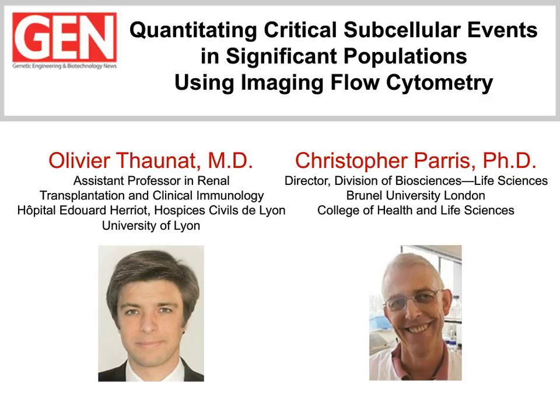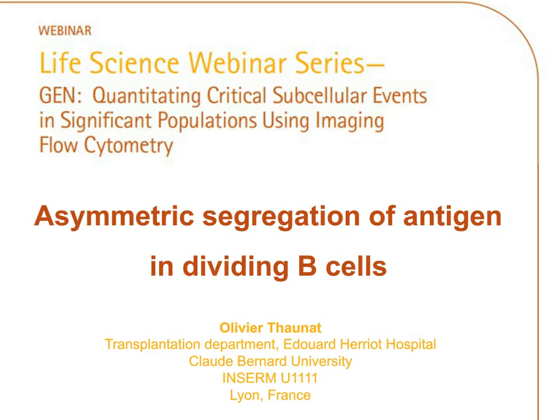Hello everybody. My name is Olivier Thaunat. I'm an MD PhD in Lyon, France. And in my group, we're interested in trying to understand some basic aspects of B-cell biology. What I'd like to convince you of today is that imaging flow cytometry is a technology that is really worth keeping in mind whenever you design your own research. And I will try to convince you of that by using some data we have generated in my group.